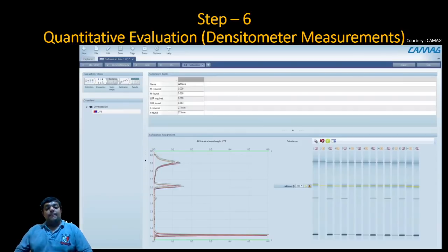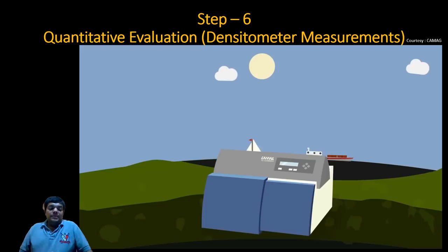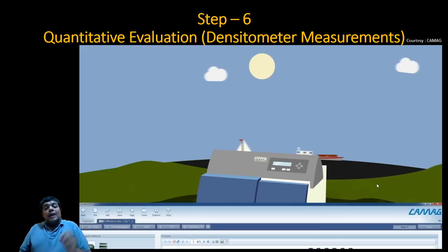Assignment of each separated compound at its optimum wavelength. Choose the best fitting calibration model for evaluation and quantify via peak height or area. See the words: quantify by the peak heights or area.